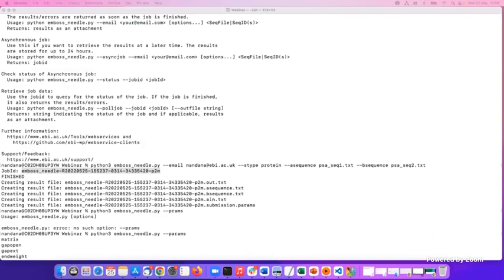Yes, you can actually. I think what he's asking is whether you can run them that way. Yes, we can, because as I showed you, we have web services clients available already. So you can use that. Or if you want to integrate the web service calls into your script, that is also possible. Okay, thank you. Did it answer your question? If you want to add anything, you can add it in the chat and we'll come back to it.